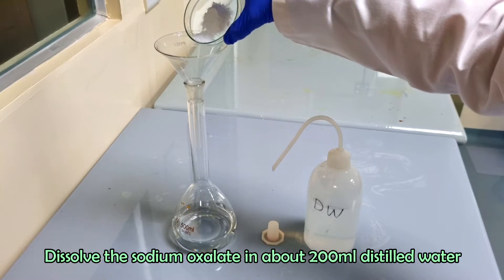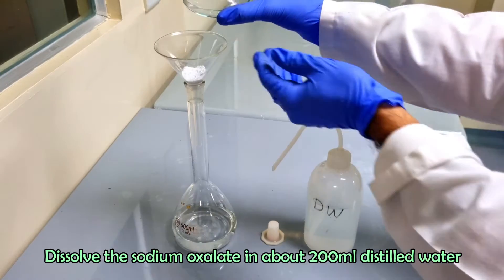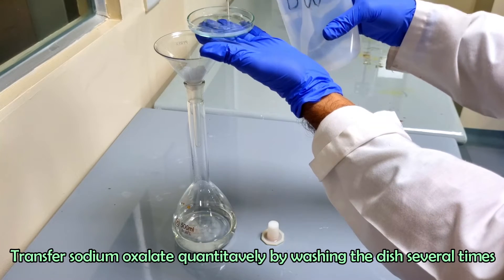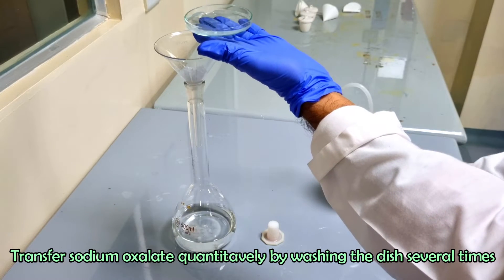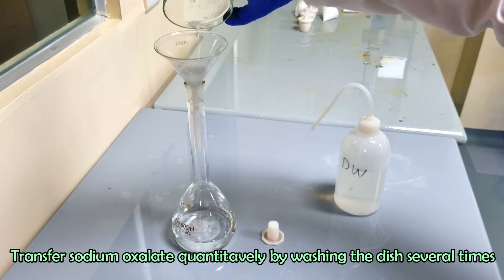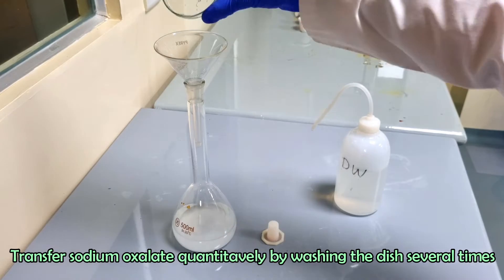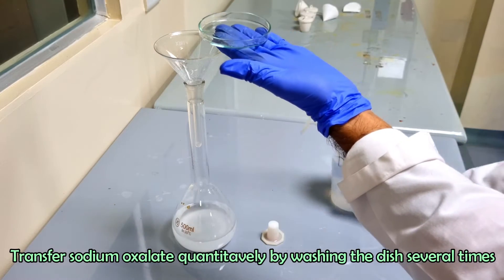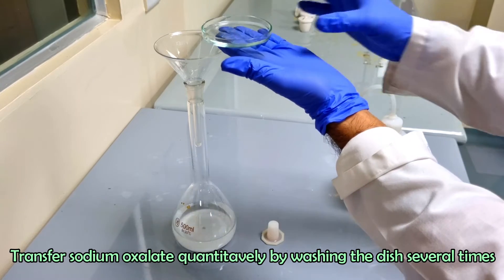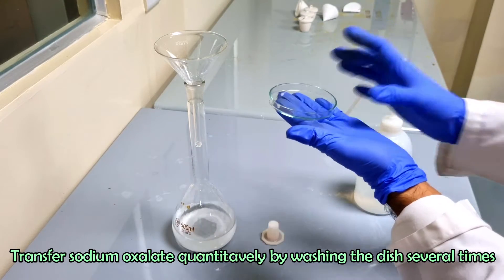Dissolve the sodium oxalate in about 200 ml of distilled water. Transfer the sodium oxalate quantitatively by washing the dish several times. Swirl and shake the flask to dissolve it in the water.